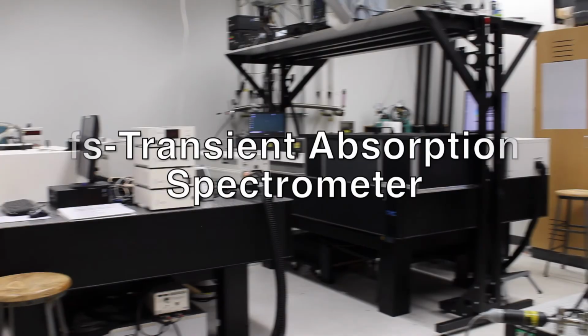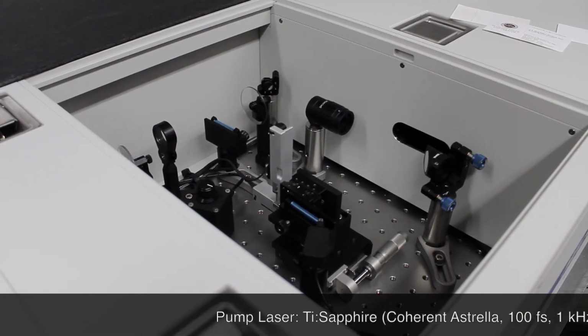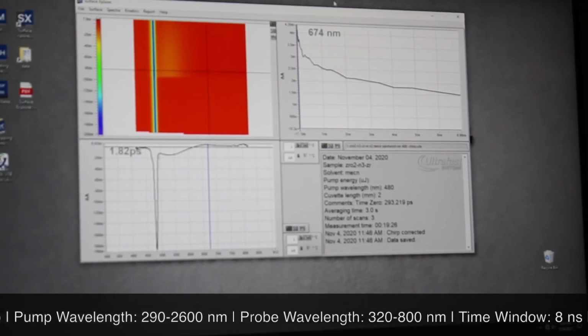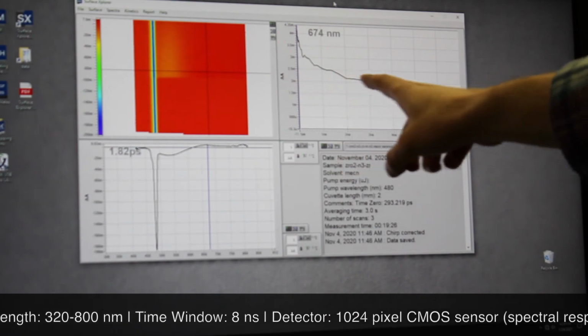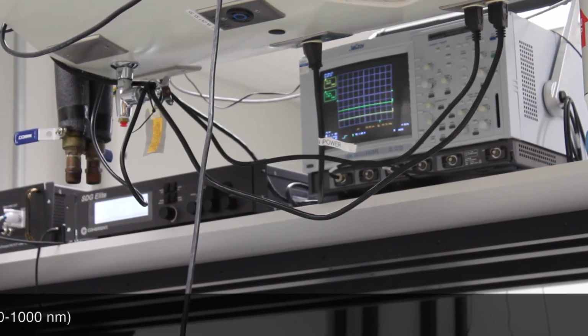The femtosecond transient absorption spectrometer is used for spectral and kinetic investigations of photoexcitation events on the femtosecond timescale. The femtosecond TA operates similarly to the nanosecond TA, with the added benefit of shorter time gates achieved by its impressive internal optics.